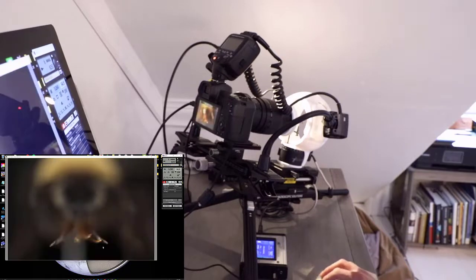And we can compare how dark this area is down here compared to what we're seeing on the specimen. Typically, if we have some information up here that's lighter in color, like we're actually seeing colors where we have browns and blues, it's a really good sign in comparison with the background, which is going to be jet black. Because we are trying to reveal as much detail in the specimen as possible, it's not a bad idea to just make the image a tad bit brighter.